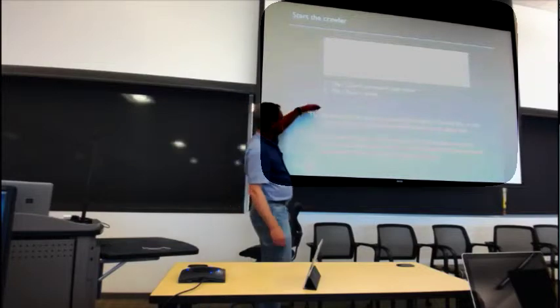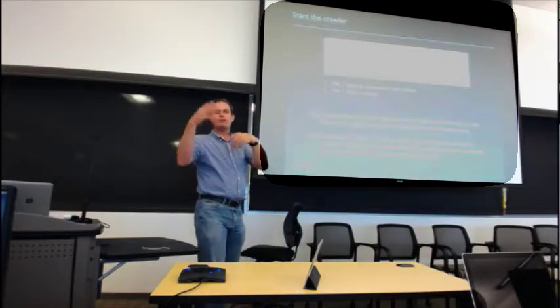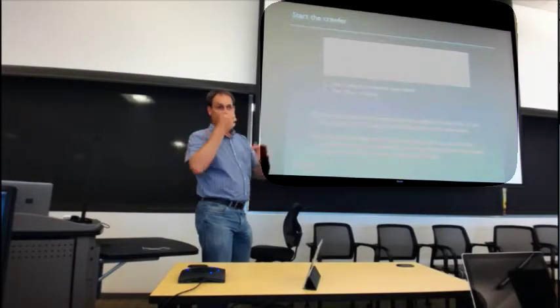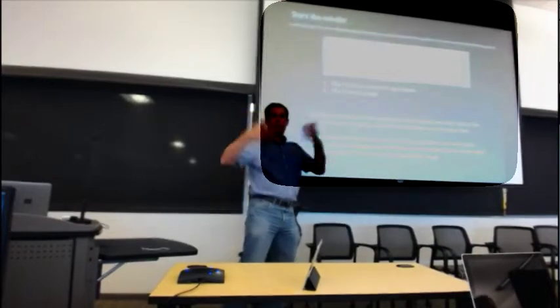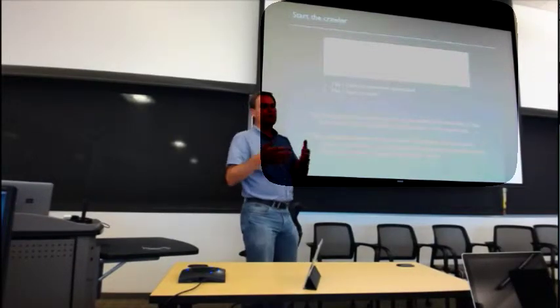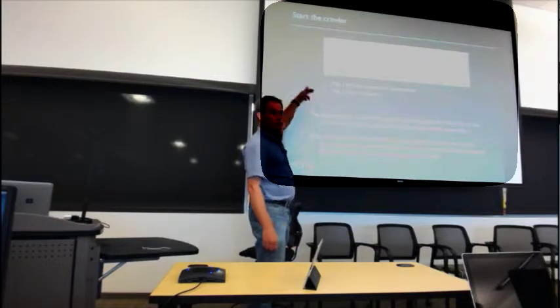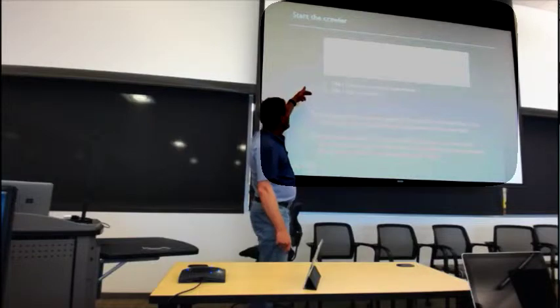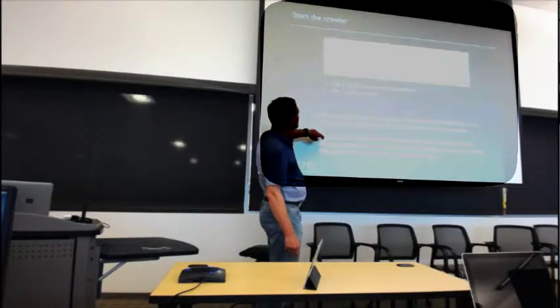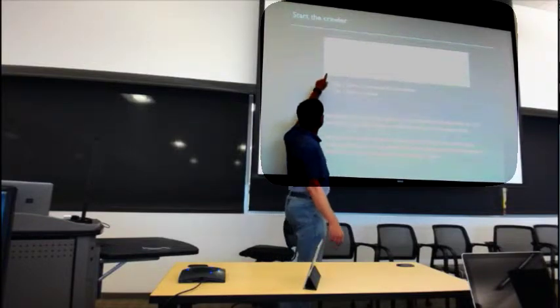Now what happens here? When you're running this crawler in the background, it's basically just updating a bunch of text files that it displays on this table. If two people do that at the same time within the one directory space, you can end up with a bit of a race condition. So many people can view this table and the data, but only one should be controlling things at any time.